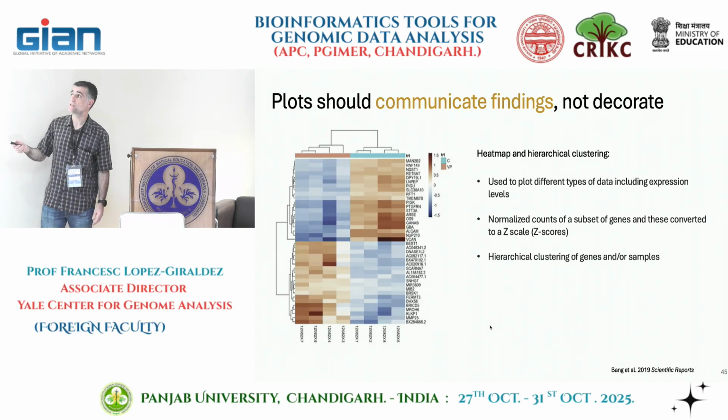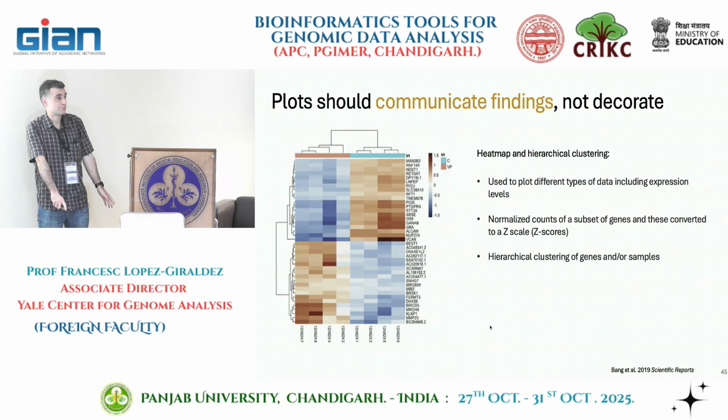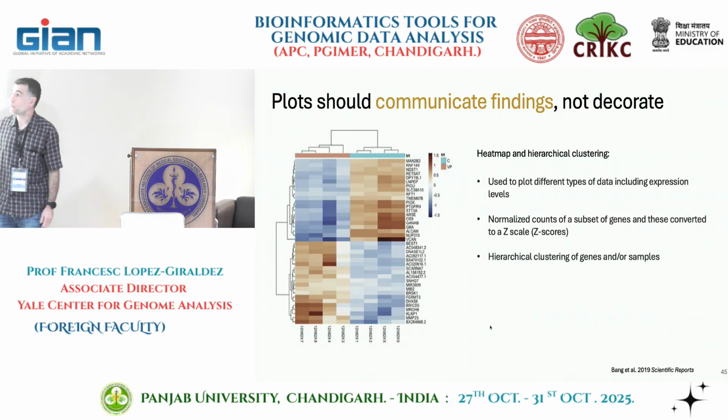Going fast to this, do you think the PCA and the heat map tell the same story? Or let's put it differently. Do you think that there's a good clustering of samples here? Yes, it seems, but not broad. Yes, it depends. Anybody want to say something stronger? Yes or no? We don't know. I'll tell you why we don't know. I don't know how they selected those genes.